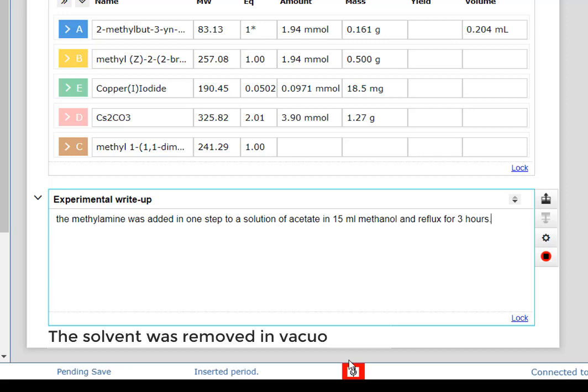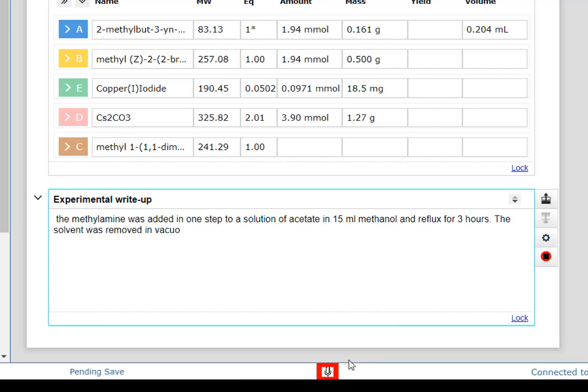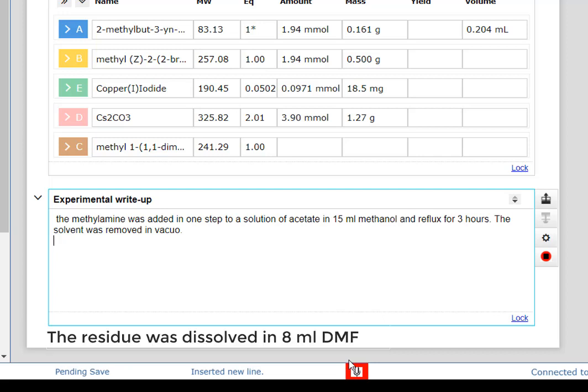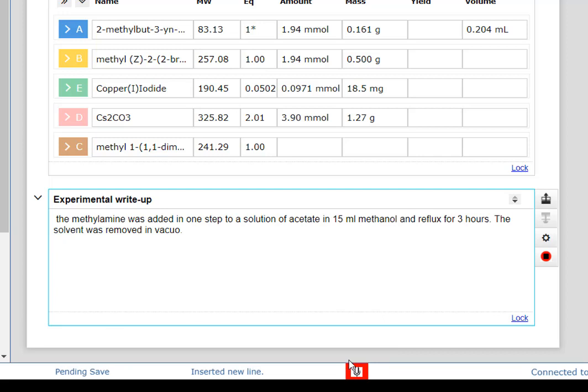The solvent was removed in vacuum. The residue was dissolved in 8 mL DMF.